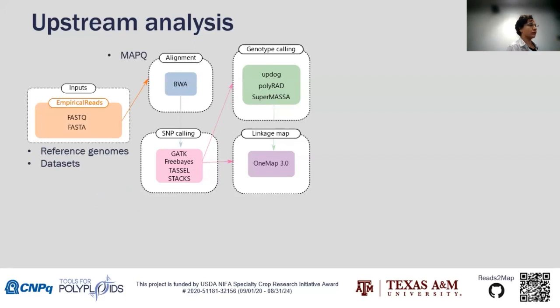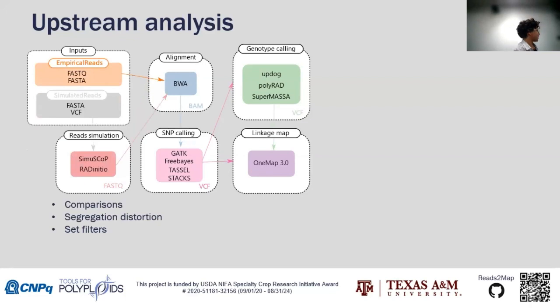Other parameters can also be changed in the alignment, like the quality of the alignment, and depending on your data set, you have different results. We could also change the reference genome and the characteristics of the data set, like if it's low depth or higher depth, how frequent the enzyme is, and what the genome species is. So it's all different. And if we wanted to give recommendations, we didn't have a gold standard.